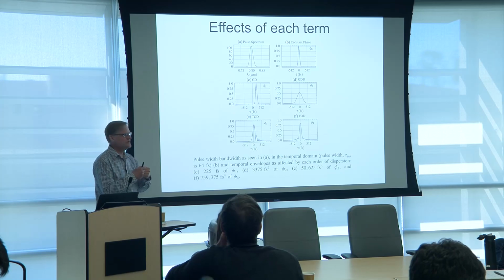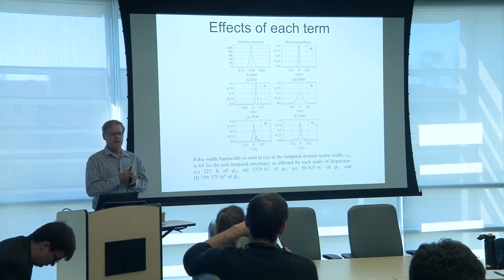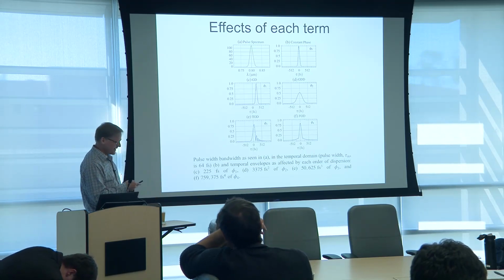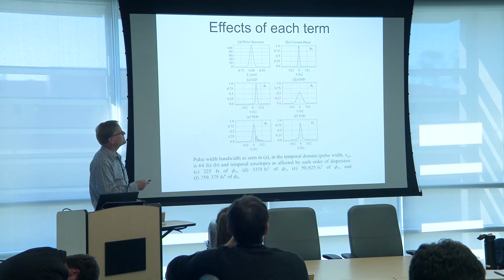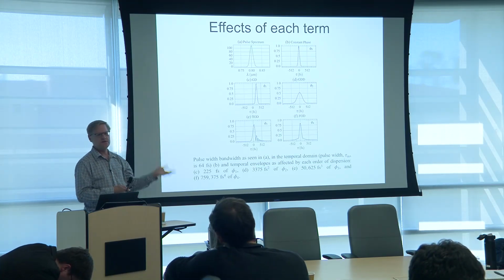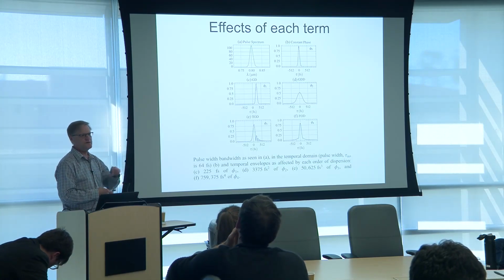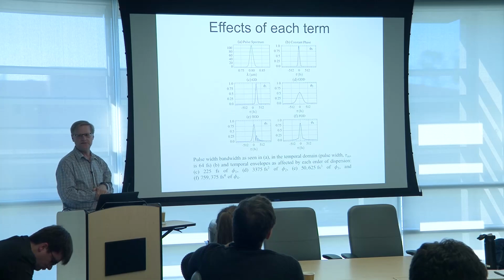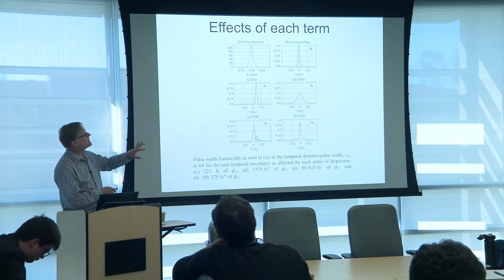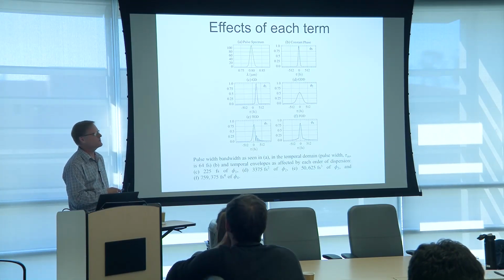So your integrated pulse width at the focus could actually be much larger than what you think it is. Group delay dispersion is where the different wavelengths start to walk off from one another, and so they start to stretch your pulse. So now it's getting longer. And if you're using nonlinear processes to generate image contrast, the efficiency at which you're doing that starts to diminish. Okay. Third order dispersion: we're turning on each term individually and turning off all the other ones so you can really isolate and see what each one does.